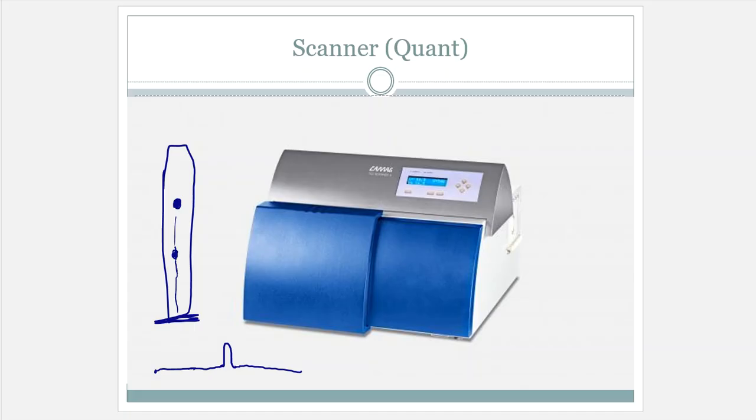So flat, flat, flat, flat. And then it goes, there's something that's there. I'm going to absorb. And then whoop, and then it goes back down to baseline. So in the world of chromatography, folks, this is what HPLC would be doing too. It's a detector, and it's saying nothing, nothing, nothing, and then, I see something coming out of the tunnel. Well, the same thing's happening here with the scanners. It's just not coming out of a tunnel.